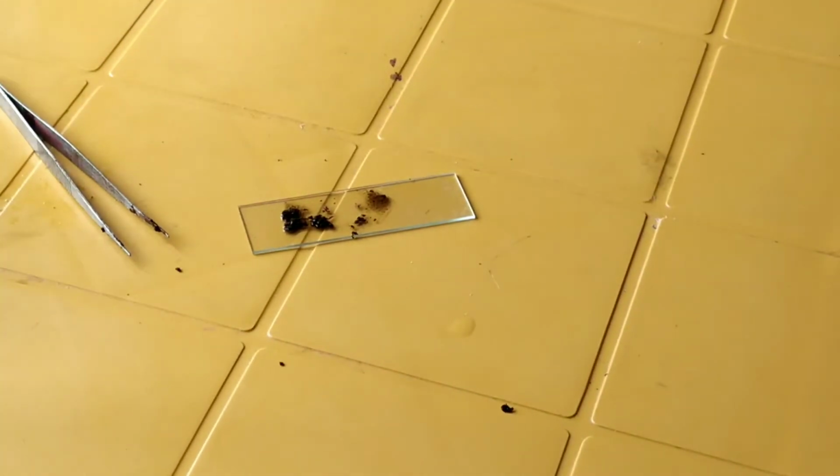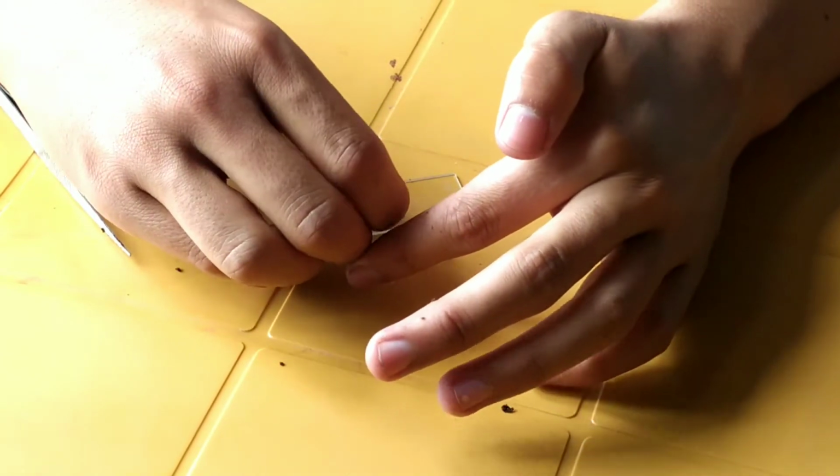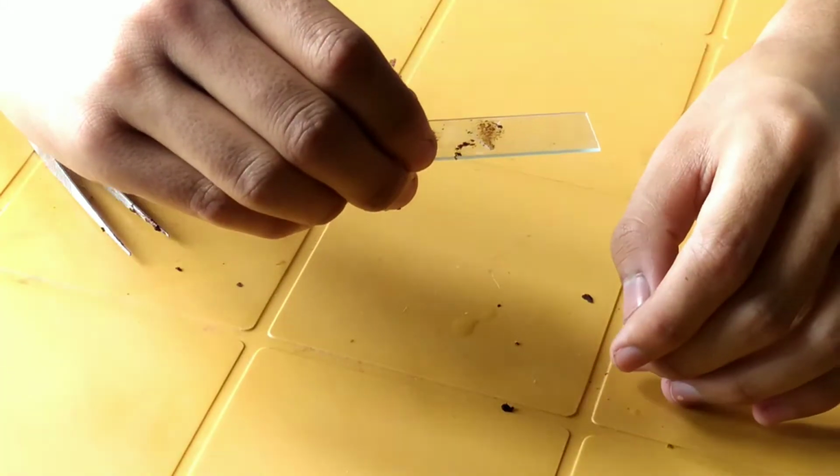So I'm going to cover it with the cover slip. So now our microscope slide is ready.